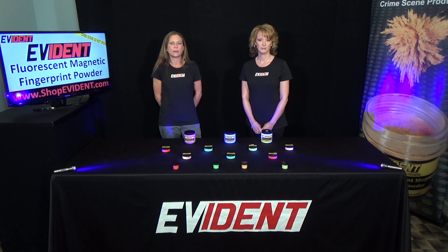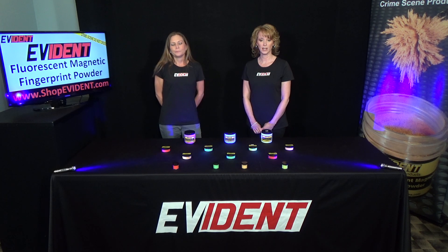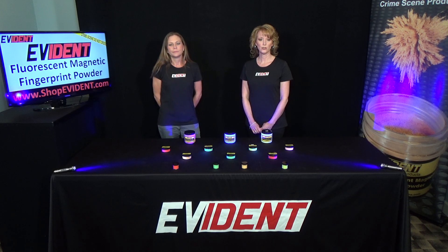Simply insert the tip of the applicator into the magnetic powder to pick up a small amount. The metallic properties of the powder attract them to the magnetic tip of the applicator. Use the applicator to gently apply the powder to a small area.